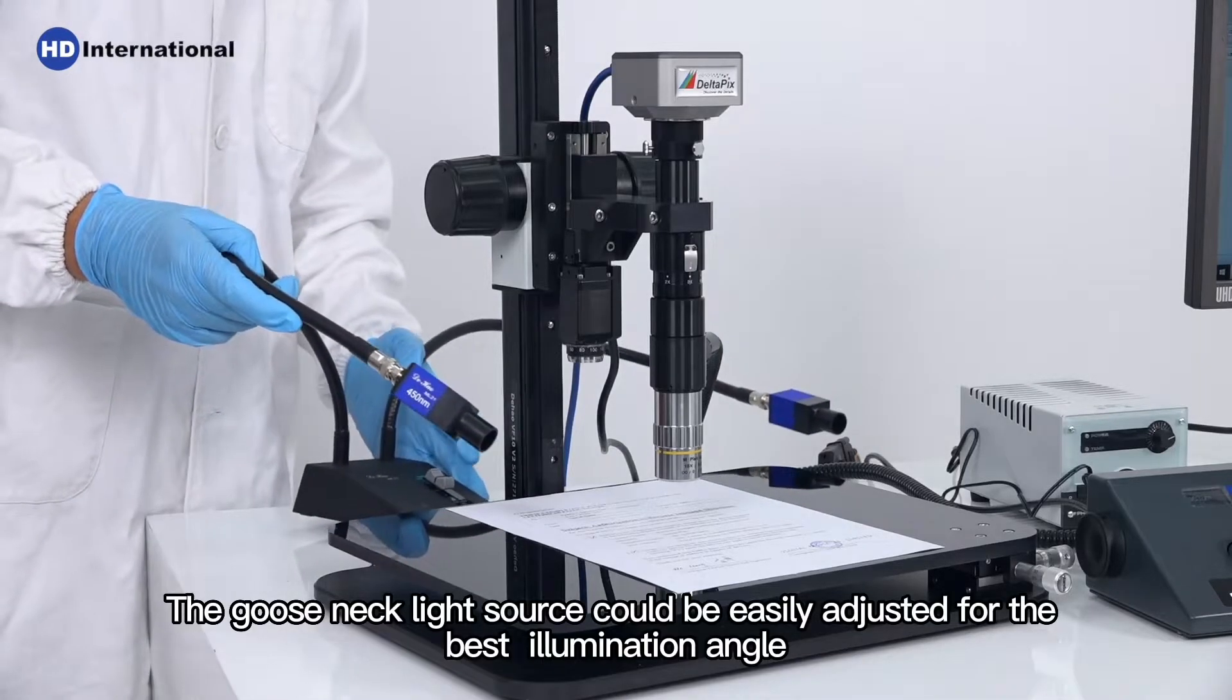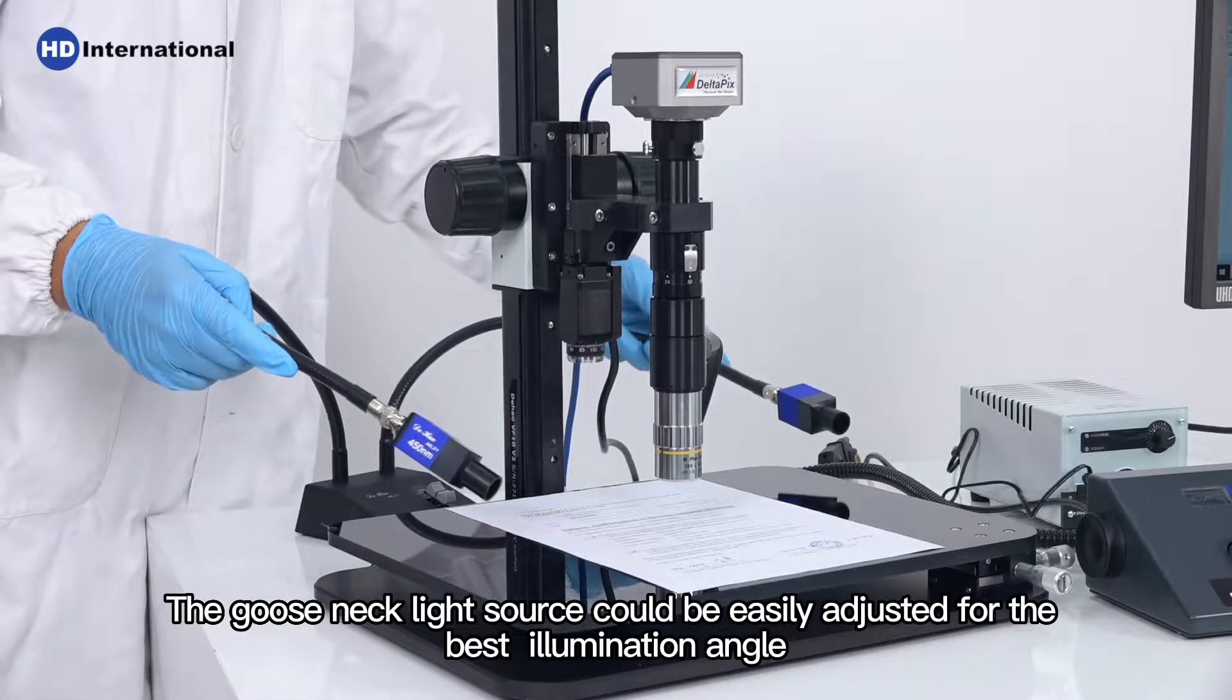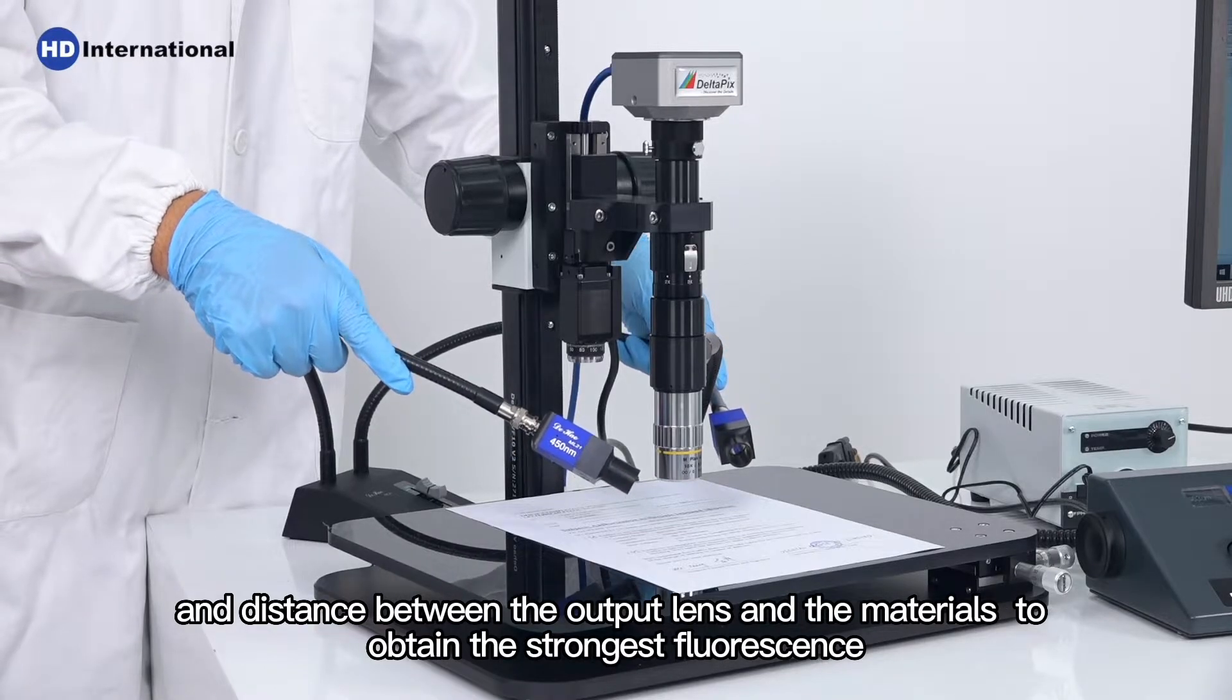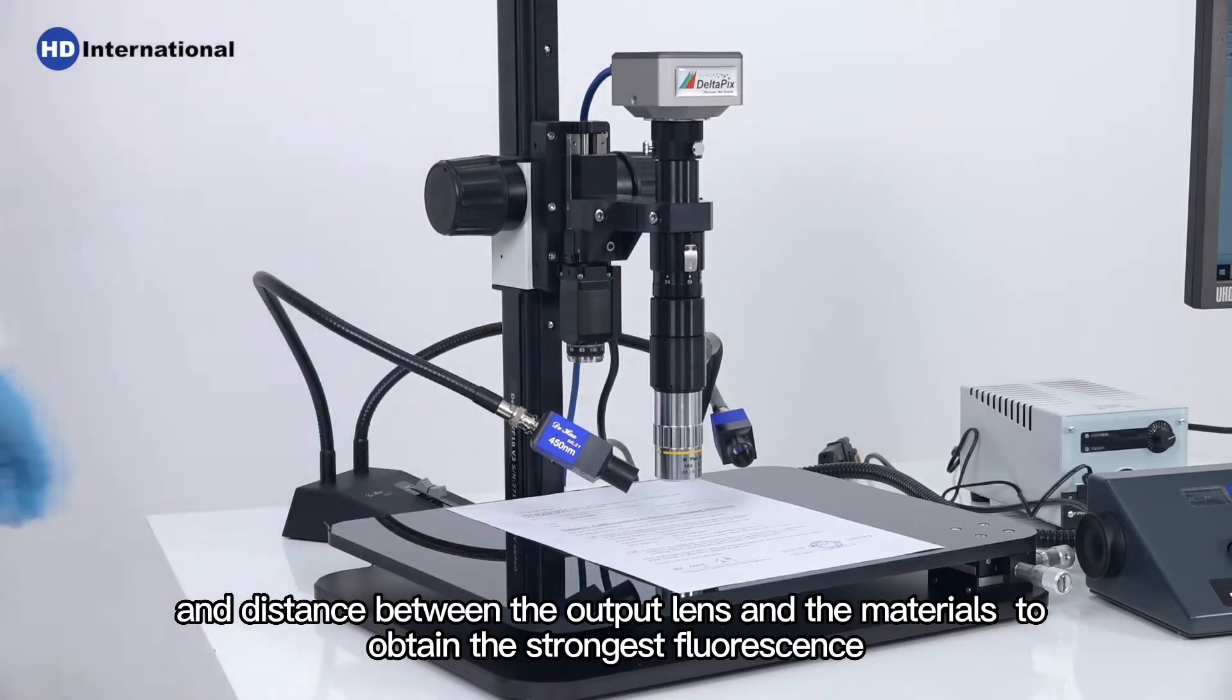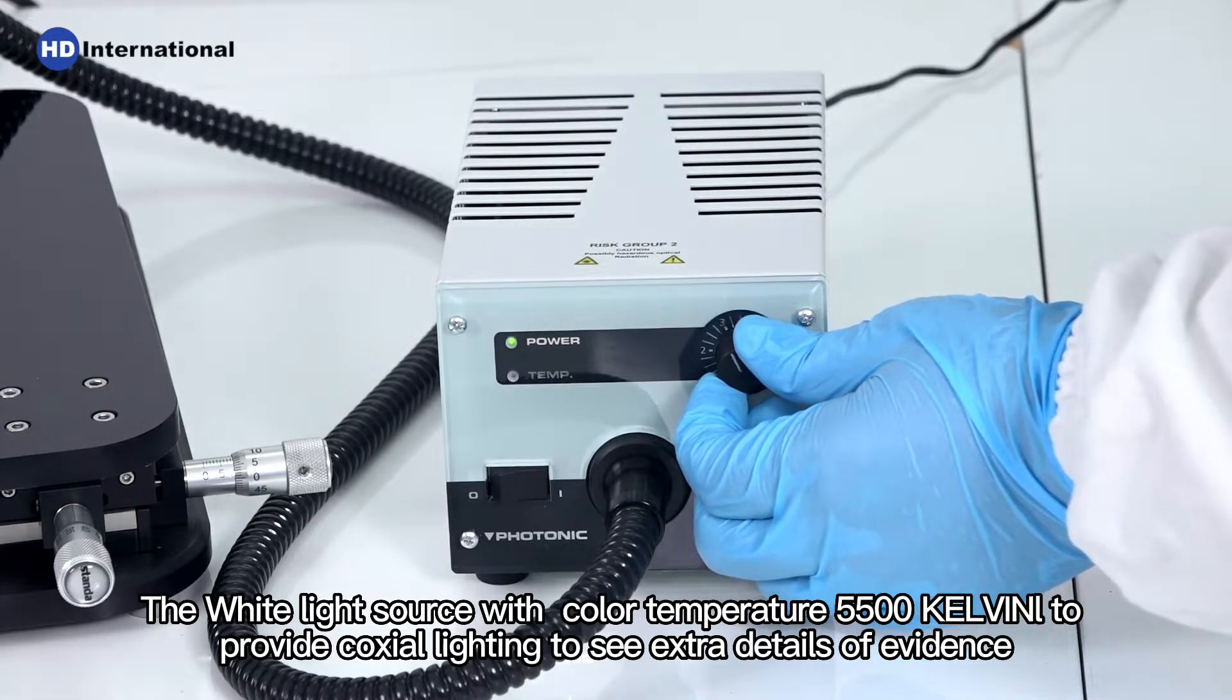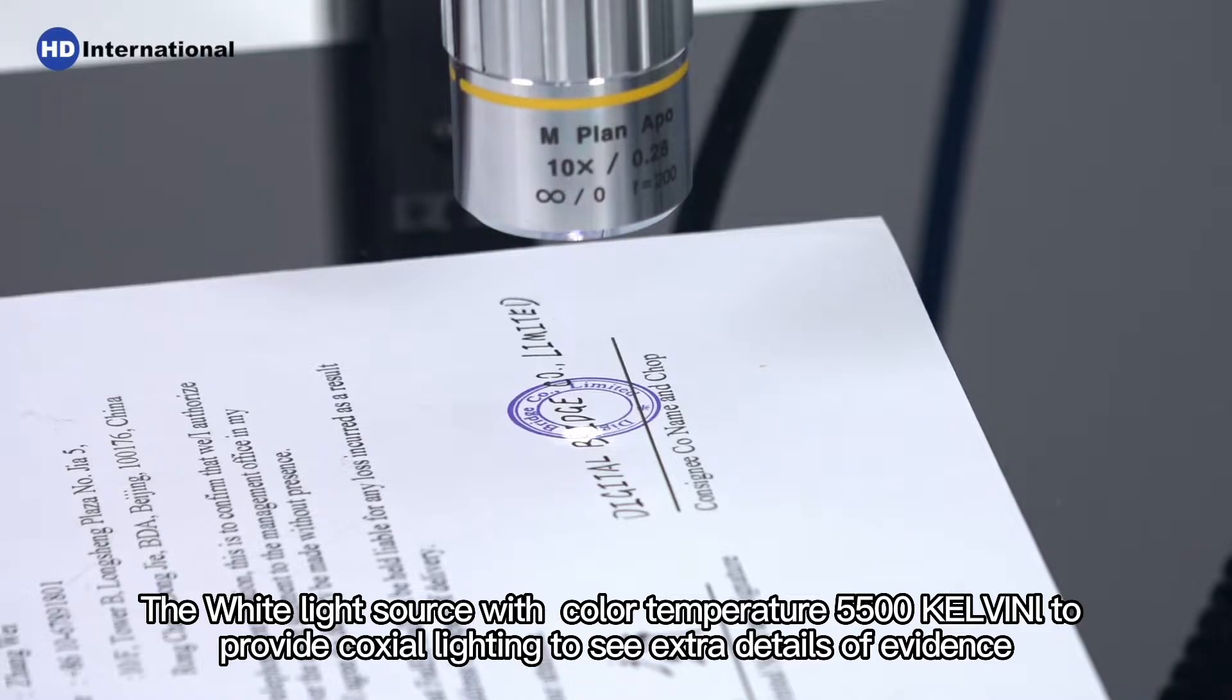The gooseneck light source can be easily adjusted for the best illumination angle and distance between the output lens and the materials to obtain the strongest fluorescence. The white light source with color temperature 5500 Kelvin provides coaxial lighting to see extra details of evidence.